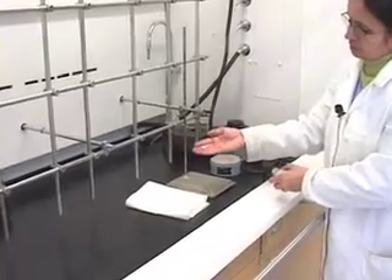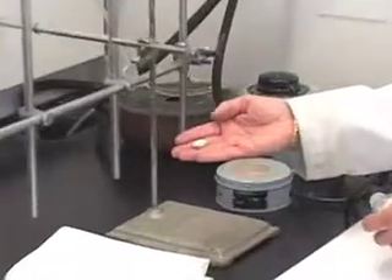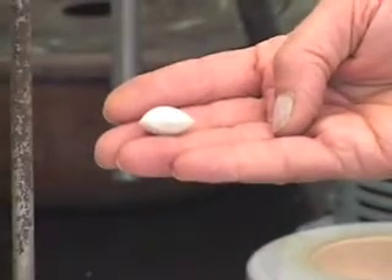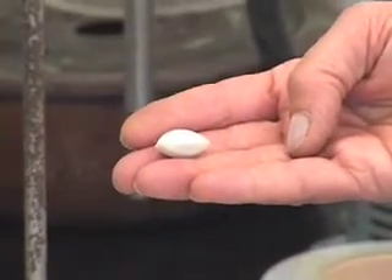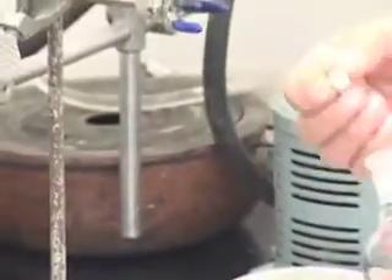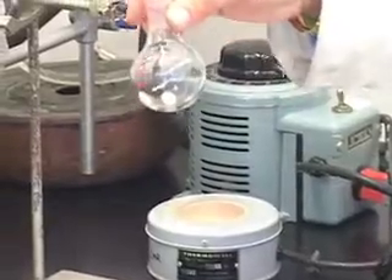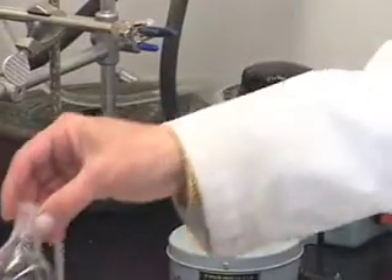This is what a magnetic stir bar looks like. This is called an oval shaped, or egg shaped, magnetic stir bar. You are going to place the magnetic stir bar inside the flask. We will attach the flask shortly.